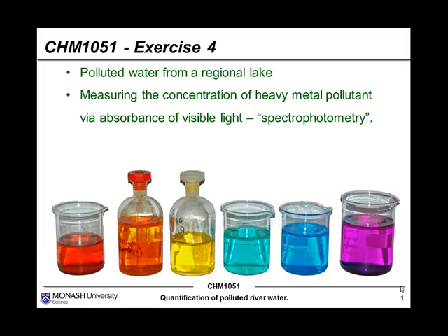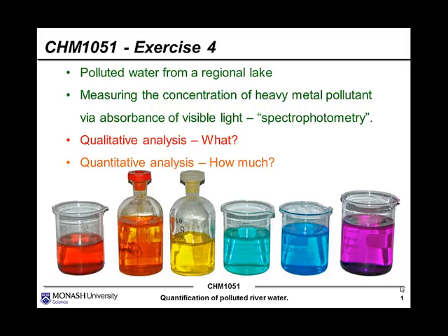So you're going to be measuring the concentration of these heavy metal pollutants, and we're going to be using spectrophotometry. In this experiment, you'll be performing both a qualitative and a quantitative analysis. In case you're not sure what I mean, in simple terms, it is what is in the solution and how much. In other words, what's the concentration of those pollutants.